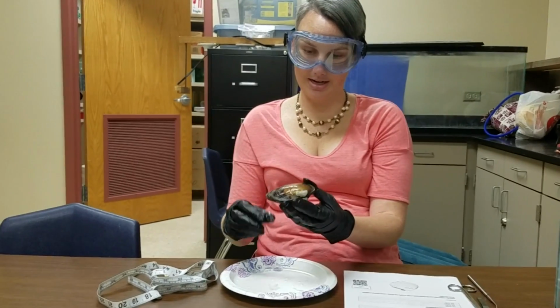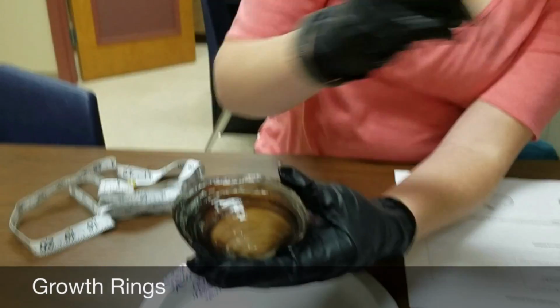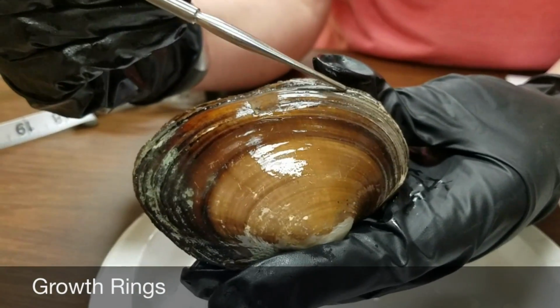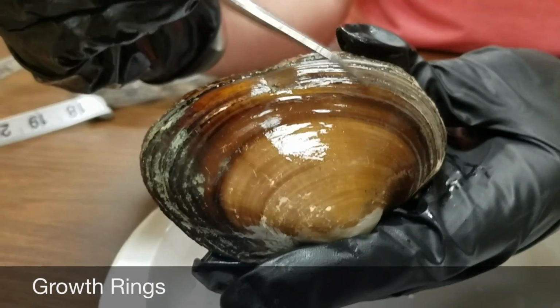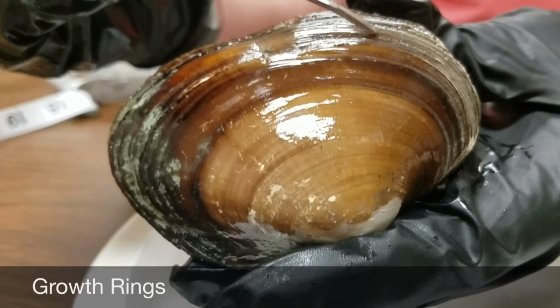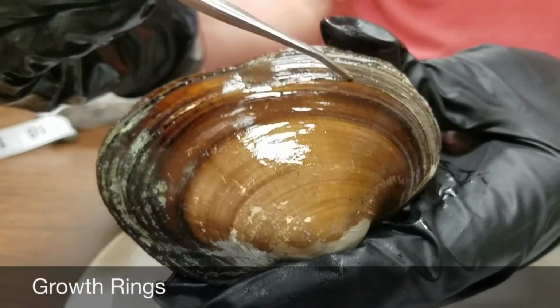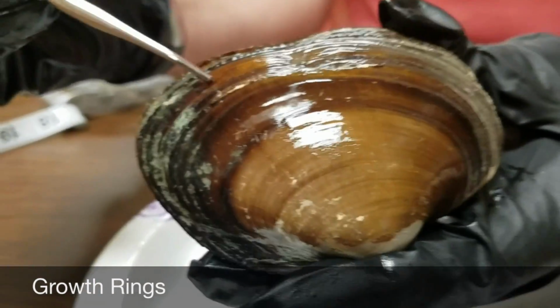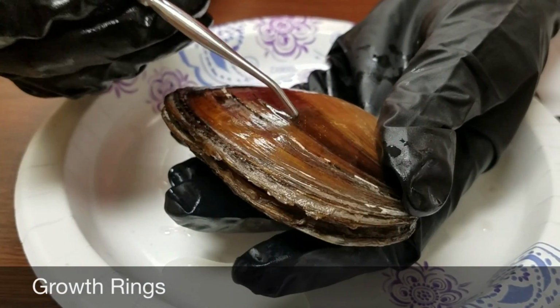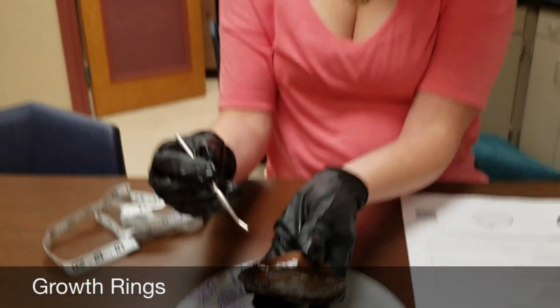Growth rings, okay? You're going to look for growth rings, and when you are looking at your shell, especially if you rub on it with your probe, you can hear it kind of sounds like castanets or something, or road bumps whenever you run over the middle of the road if you're drifting out of your lane. Try not to do that. Those are your growth rings. They grow at different rates, and they get these little growth rings in there. So it's kind of like rings on a tree. For the years that they grow, they get different little rings.